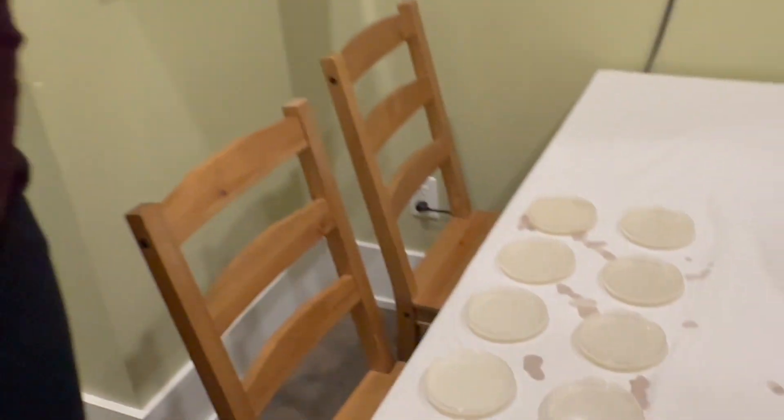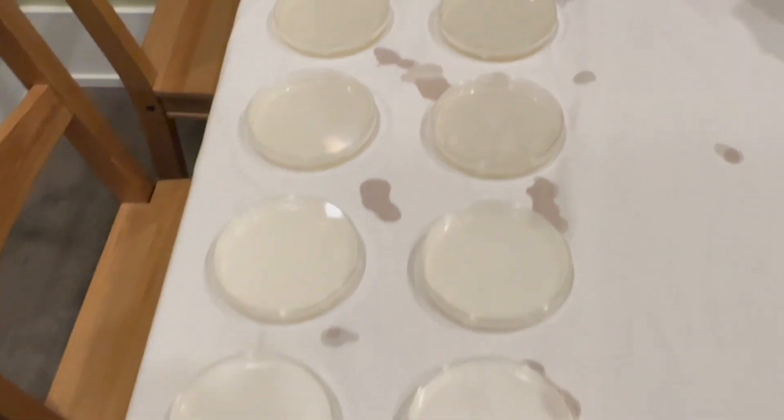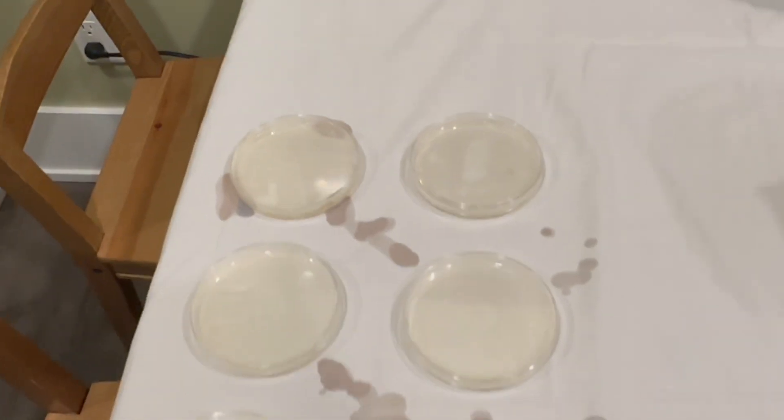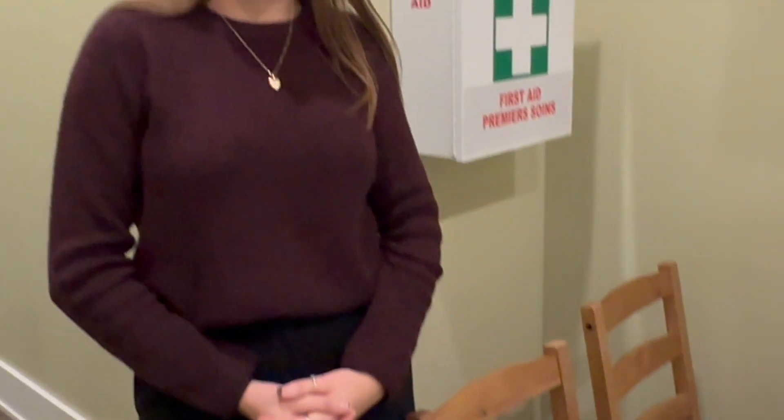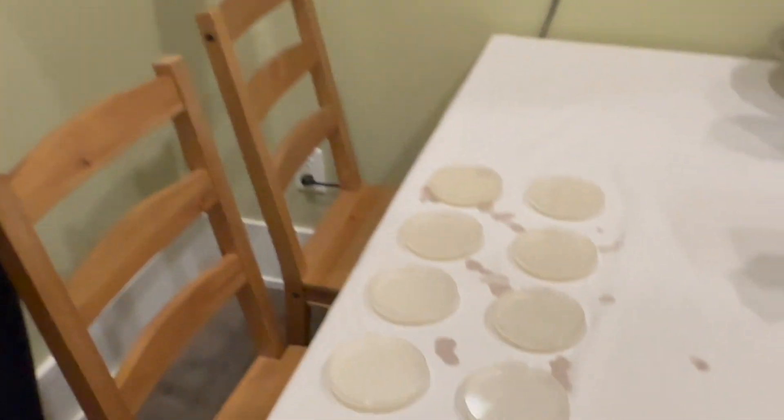Emily has finished making our petri dishes. Here they are — it was a little messy, as you can see, but that's okay. So stay tuned — we're going to start petri dishing and swabbing people's phones this week.